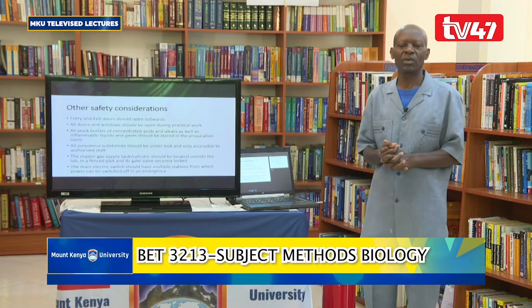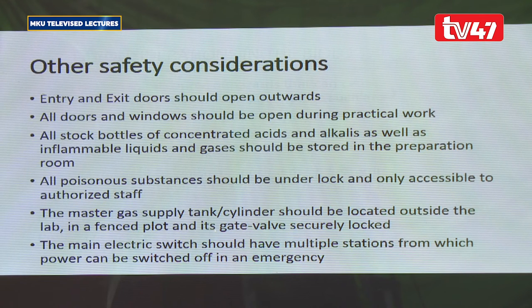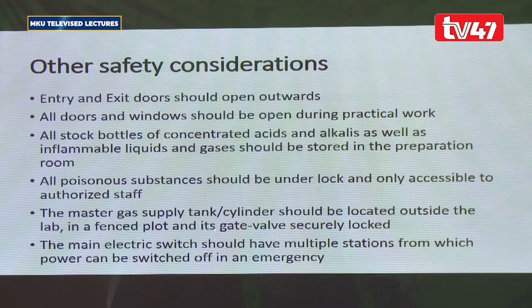Other safety considerations that every biology lab should have in mind are the entry and the exit doors. They should open outwards, not inwards, so that in case of a stampede, when the students try to get out, they can. If the door opens inwards, there will be no chance because they all want to get out and the doors will not open. But when the doors open outwards, they can actually kick them open and get out of the lab.